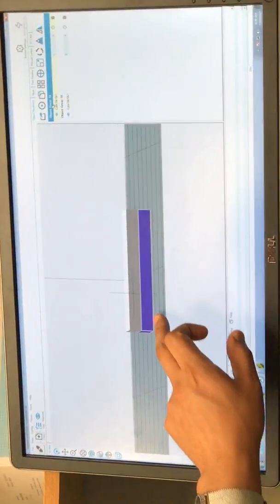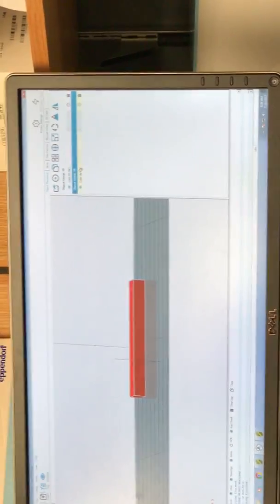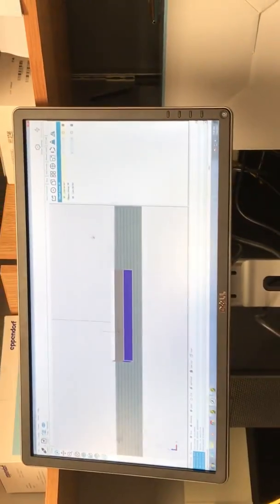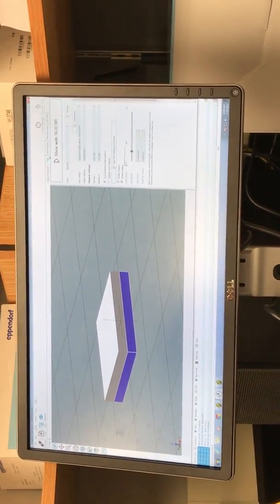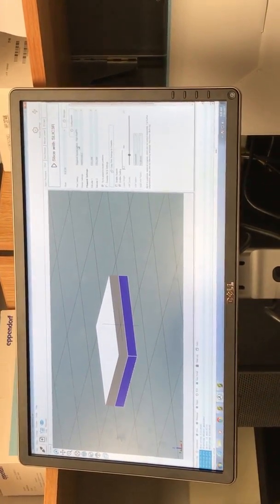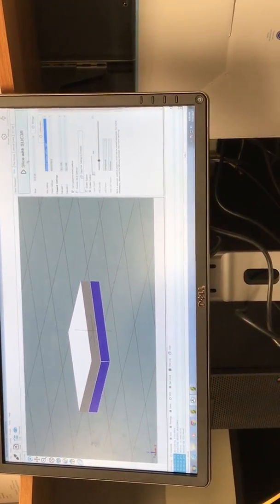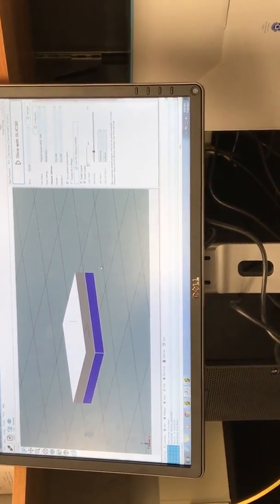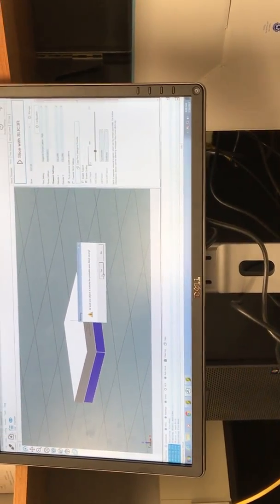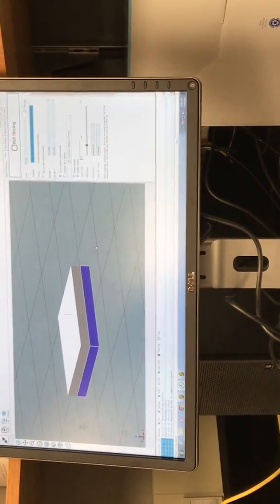So now you have print will be printed 1 and printed 2. Cool. Yeah, and then when you slice it, you can select, let's say, regular one. At least one is slicing. Yes, that's fine. This one always has a printable area for slicing.